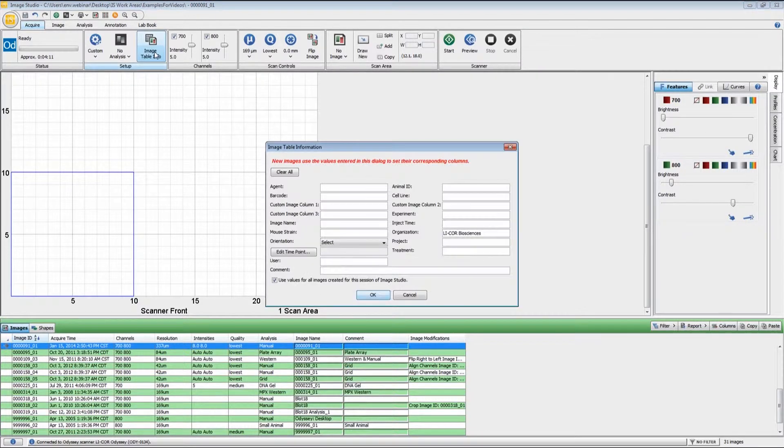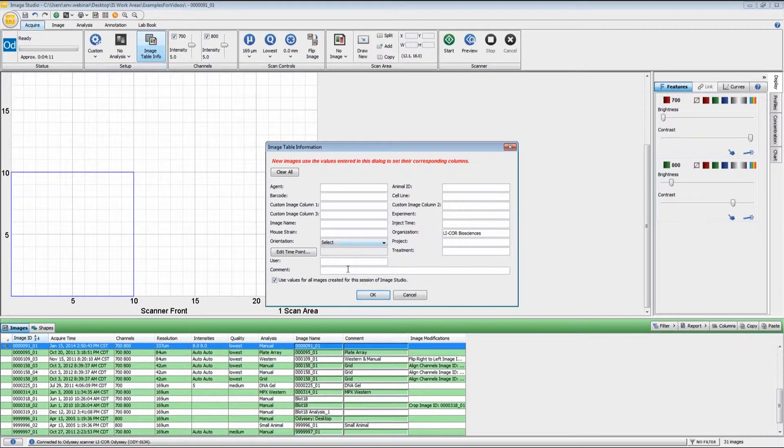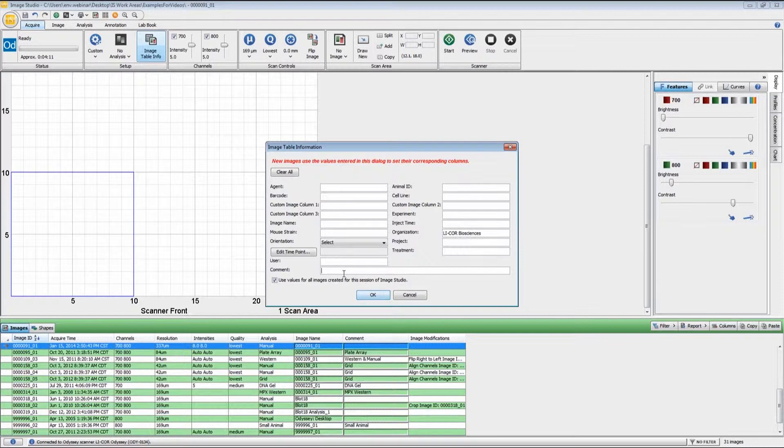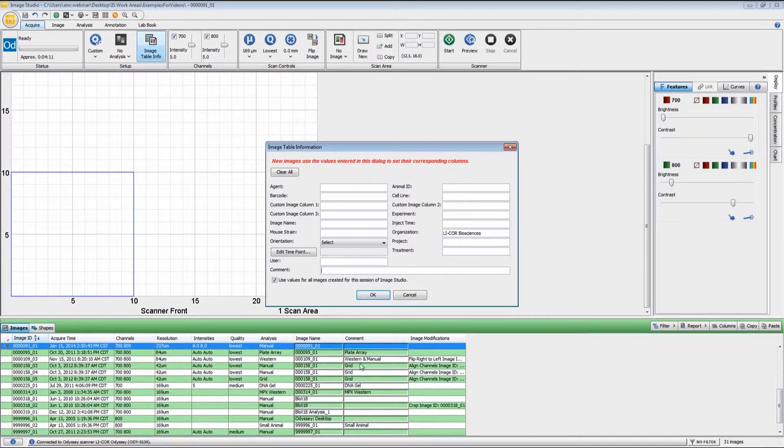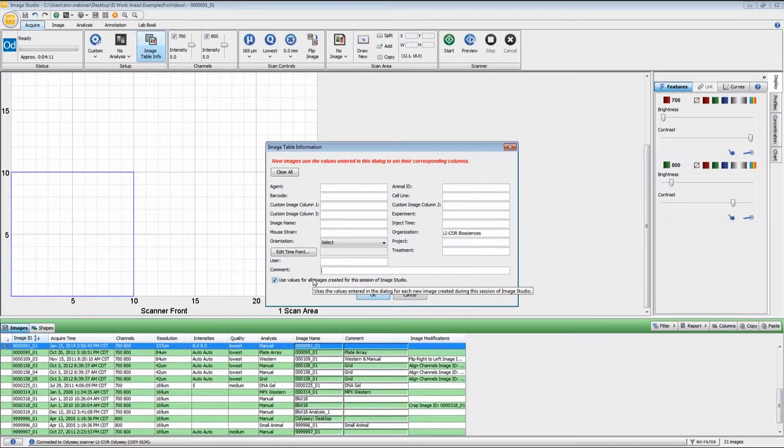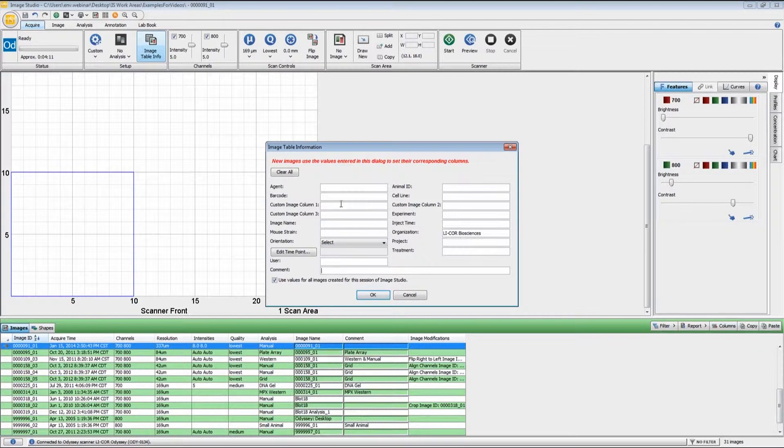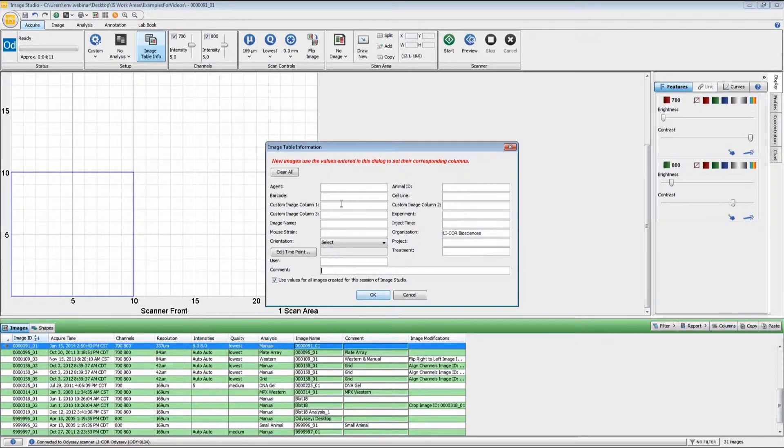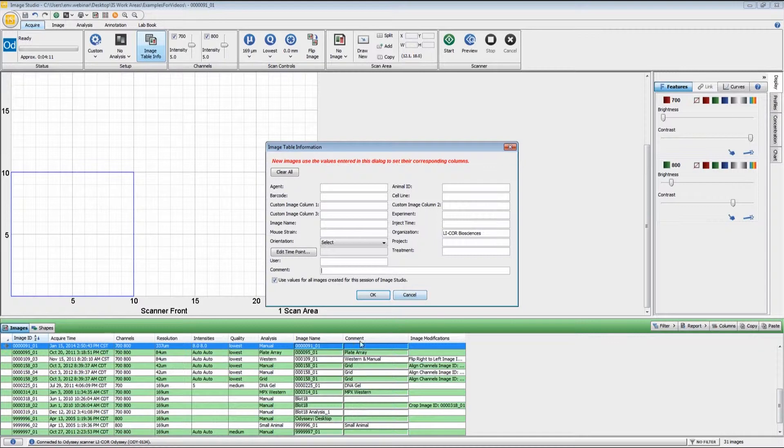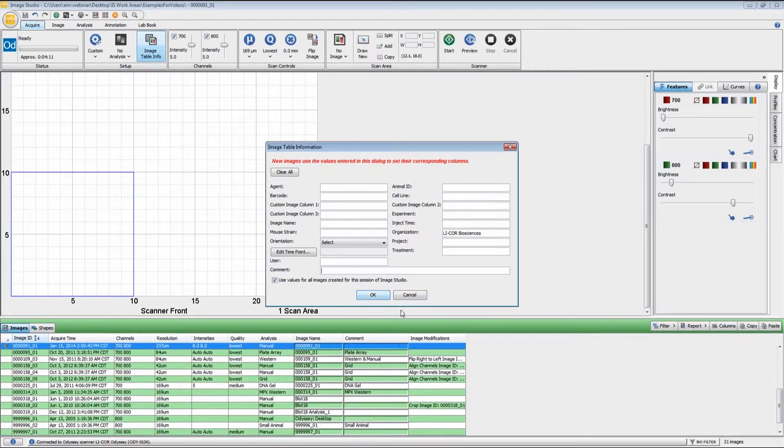The image table info allows you to enter in information about the scan before you actually start. If you would like to add information about the antibodies or the sample types that you have, you can type that in right here, and that will appear in the comment field for the specific image. If you leave this checked, this information will be applied to each of the images that you acquire during this session of Image Studio. If you close out of Image Studio and come back at a later point, you would have to re-enter that information again. But if you want to do it afterwards, you can just simply double click here in the comment field and type in that information right there.